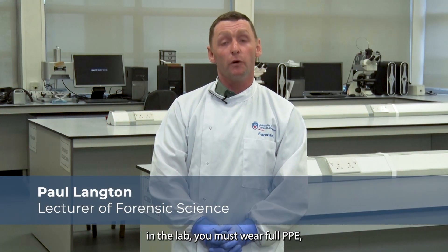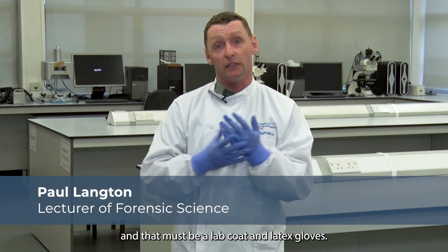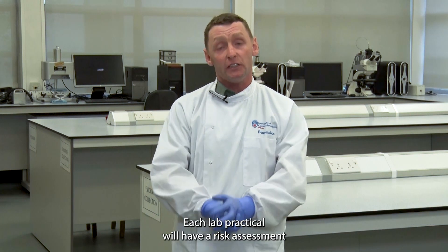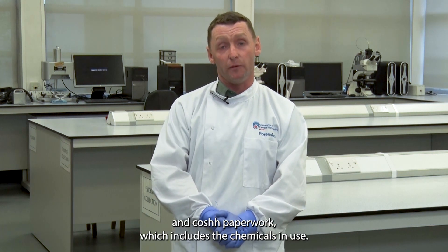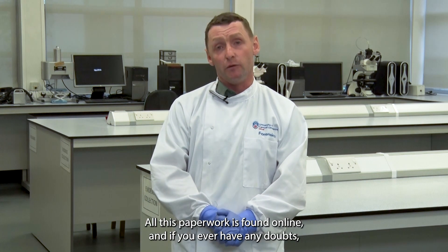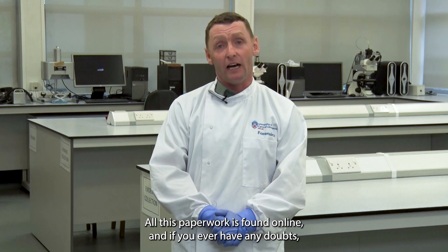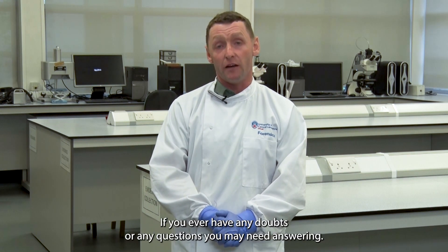When working in the lab you must wear full PPE — a lab coat and latex gloves. Each lab practical will have a risk assessment and COSH paperwork which includes the chemicals in use. All this paperwork is found online. If you ever have any doubts, the lab practicals are supervised by members of lecturing staff, and you must ask questions if you have any doubts.